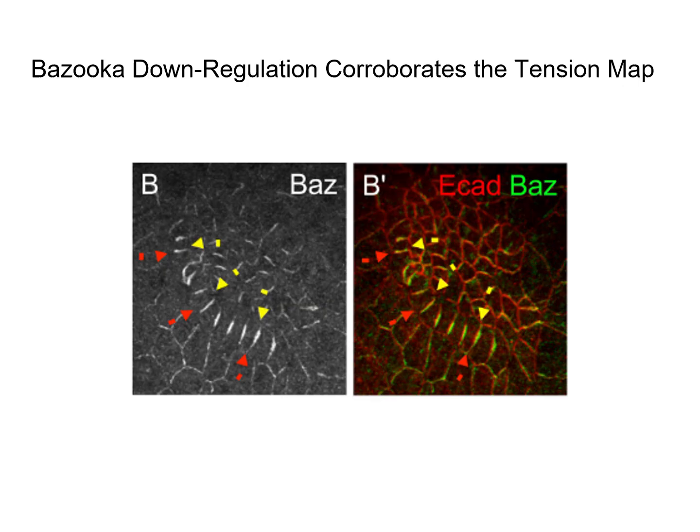Complementary to the SQH data, the bazooka signal tells a similar story, but from the opposite perspective. Here, bazooka is strongly downregulated precisely at the floor-to-roof and floor-to-midline boundaries. This complementary pattern, where regions of high myosin accumulation are proportional to the reduced bazooka levels, reinforces the notion that these boundaries are zones of high tension. Essentially, while SQH marks contractile forces, the dampening of bazooka underscores a local loss in the polarity or adhesive cues that might otherwise stabilize a flat epithelial architecture.